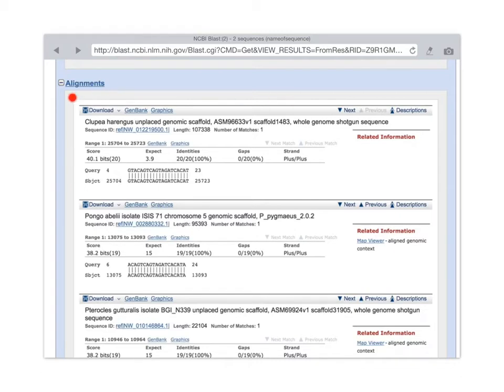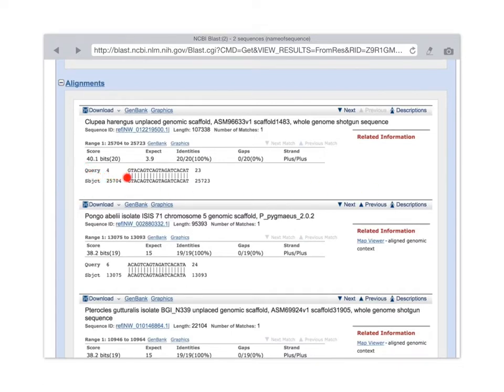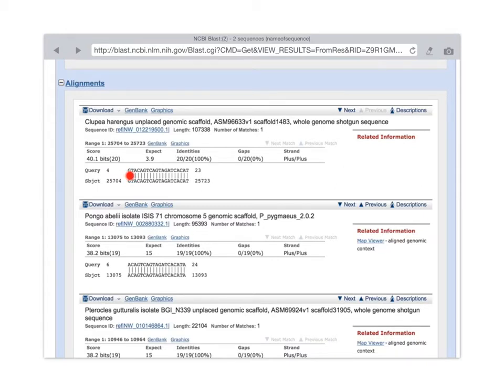So each of these sections of the alignments view represents one of those results. Here's our query sequence from nucleotide 4. So we start, it starts at nucleotide 1, but our match starts at the 4th nucleotide that I typed and goes until the 23rd.